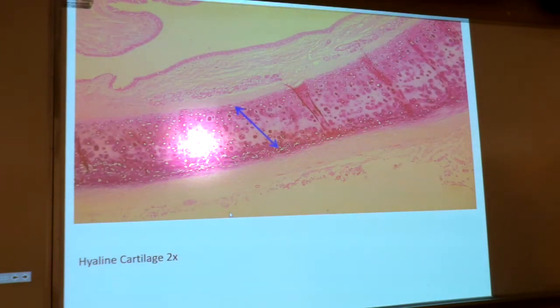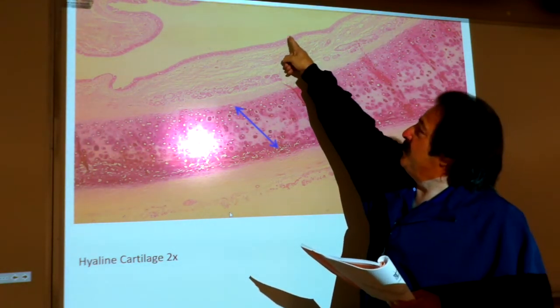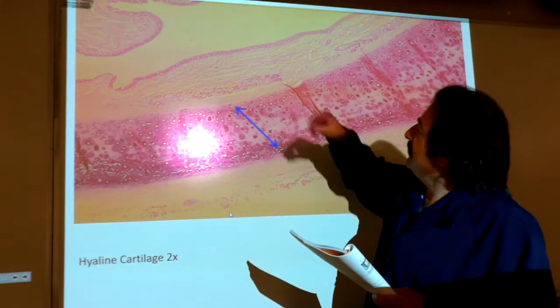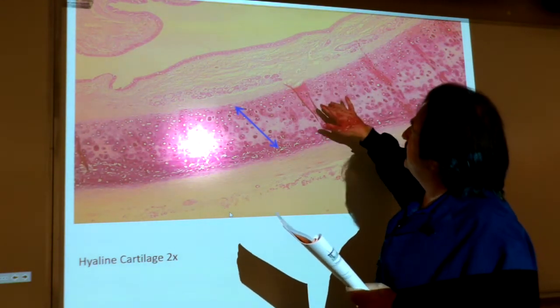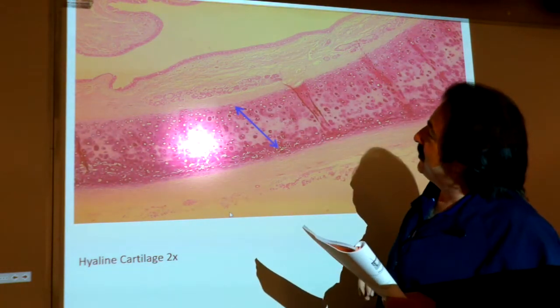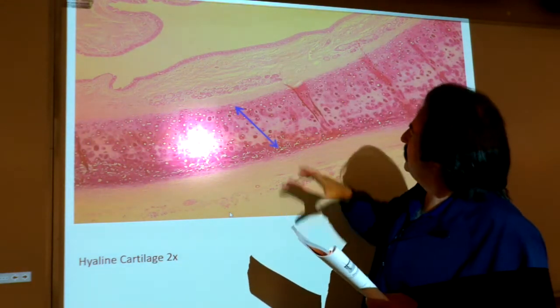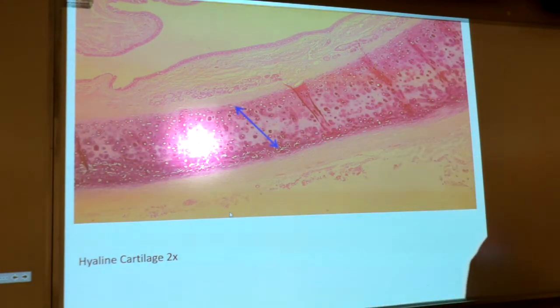All right, hyaline cartilage, and then we're back to the trachea. Remember, for epithelium, we were over here in the lumen, and the first tissue of the lumen in the apical position was the pseudostratified ciliated columnar epithelium, and we said this part is connective tissue and it's squishy, but this is hyaline cartilage. Hyaline cartilage is very, very dense. It's perhaps one of the strongest cartilages.